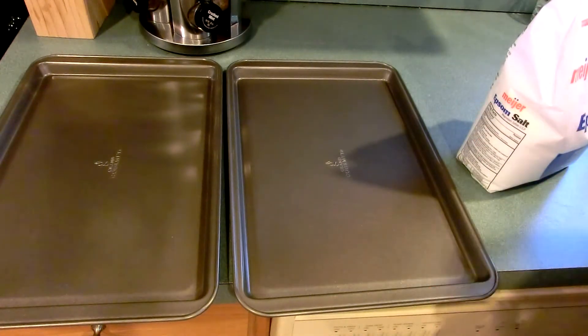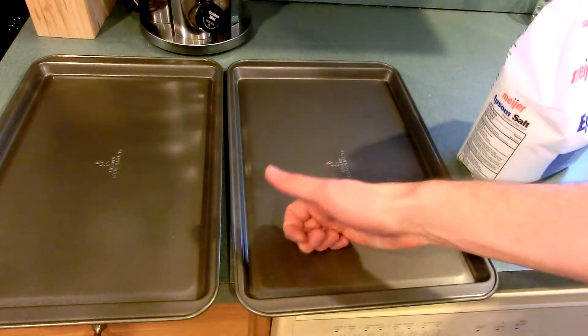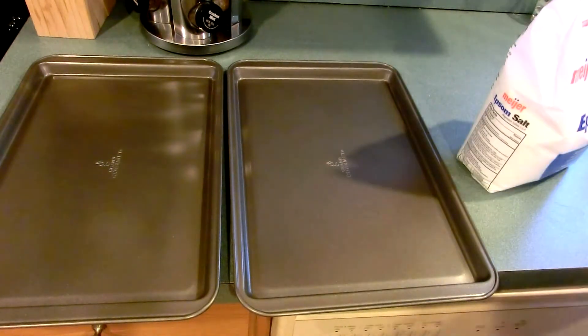Making it anhydrous is a very easy task. You'll notice that we're in my kitchen and not a laboratory, and that's because I'm doing this on a fairly large scale and I don't have a laboratory oven big enough to accommodate these large baking pans, which is what we'll use to dehydrate the magnesium sulfate.